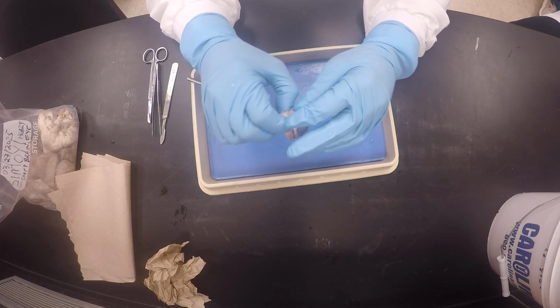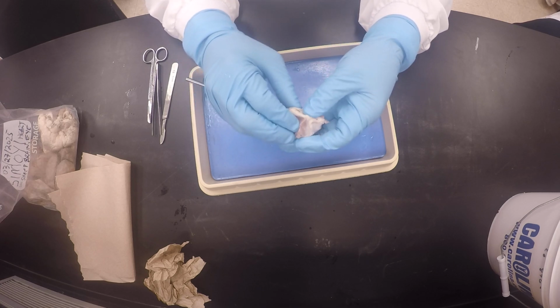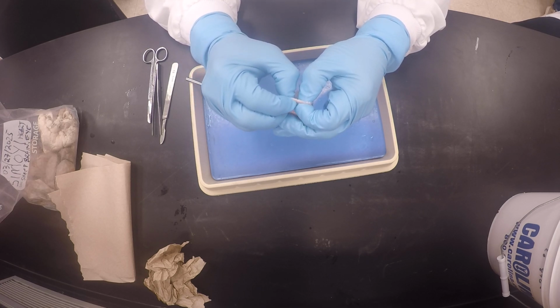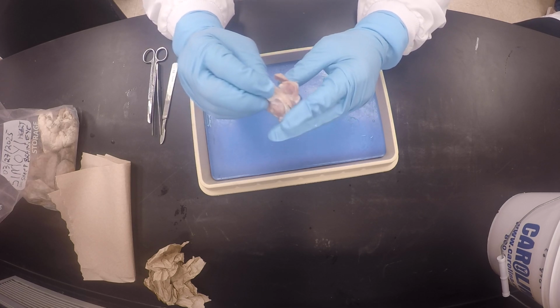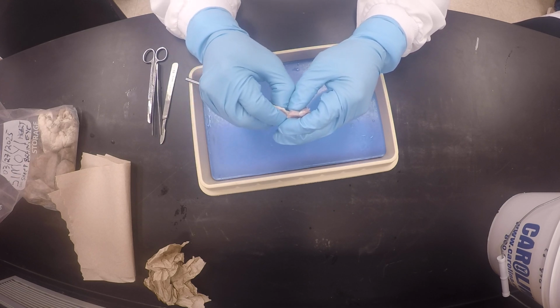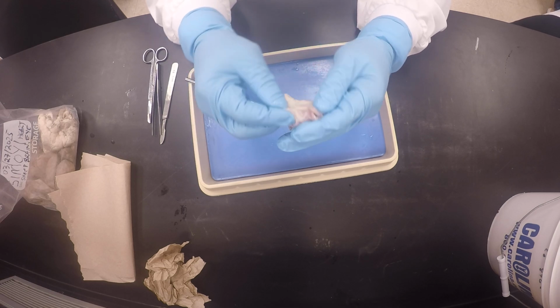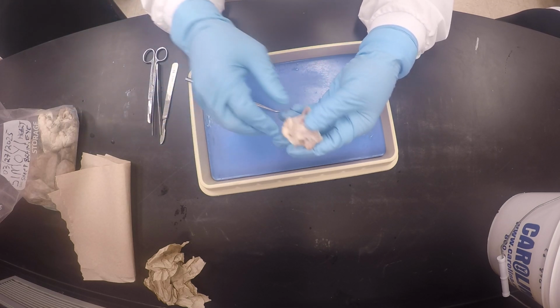Okay, my good friends. So I'm going to remove some of this fat a little bit. Remember, this is the fat that protects it from... Oh my God, I almost tore it. Because I don't want to rip off my muscles, because it took me a long time to find just this eye, you see.